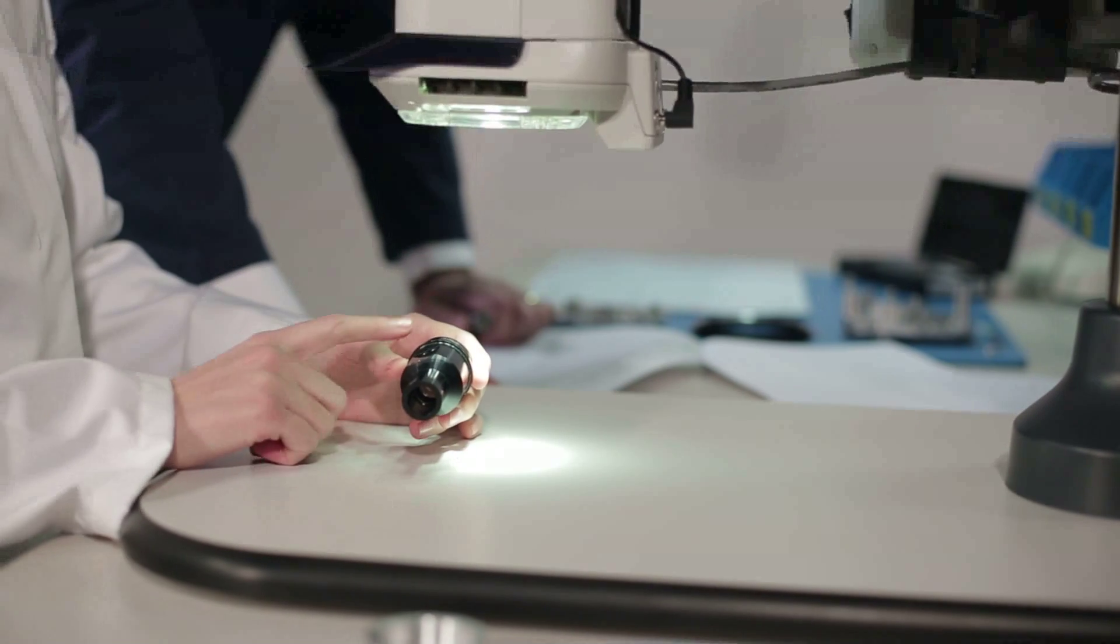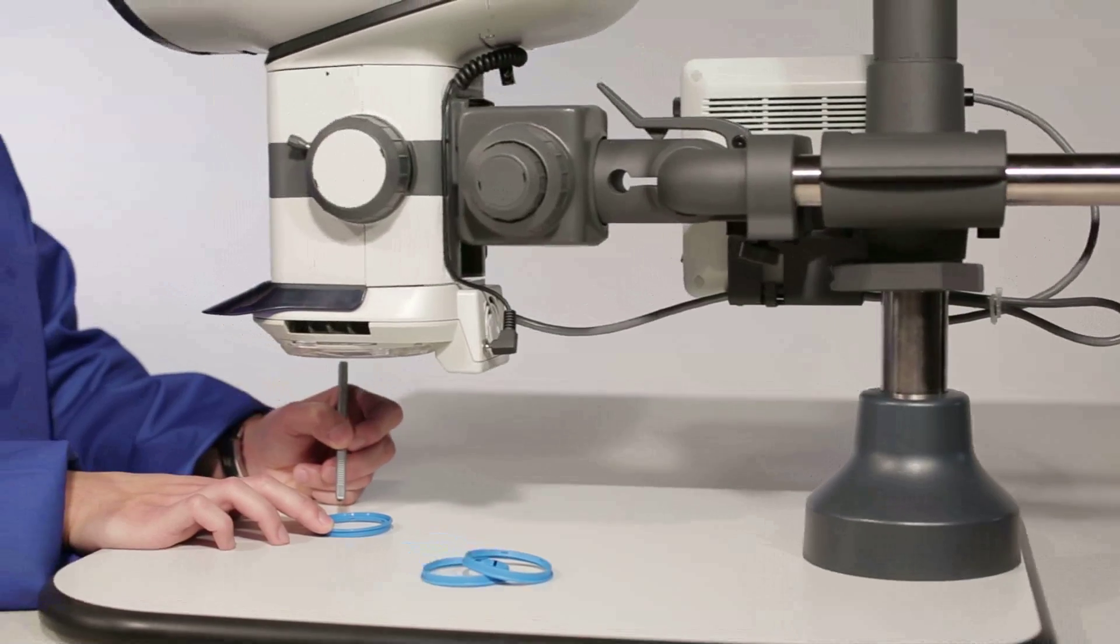Critical precision inspection tasks are easy. No fiddly eyepieces. No fatigue.